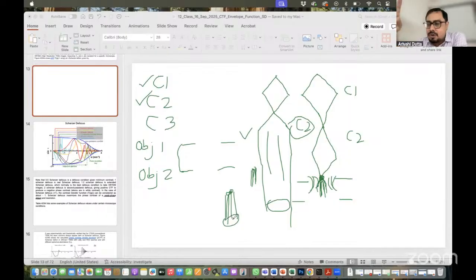Now, your second question is about the C1 lens. The C1 lens function is completely different. The C1 lens is called the spot size, right? If you are using a very strong magnetic field, the strong magnetic field means your crossover point is going very far up, in this direction.